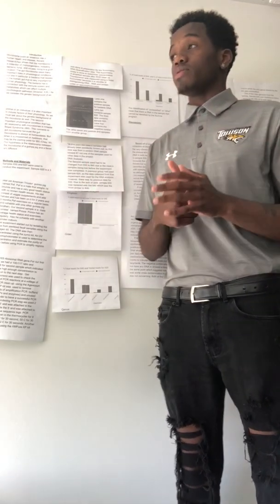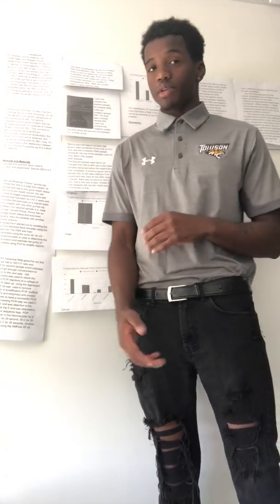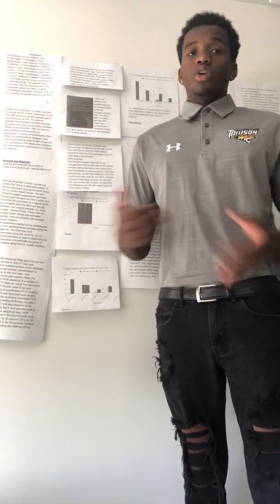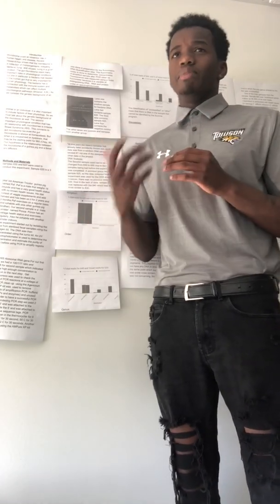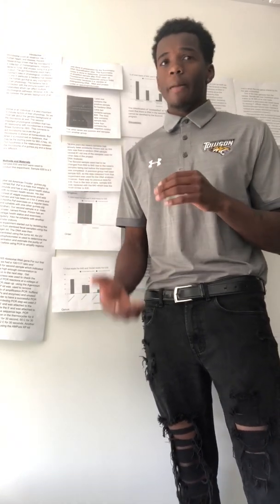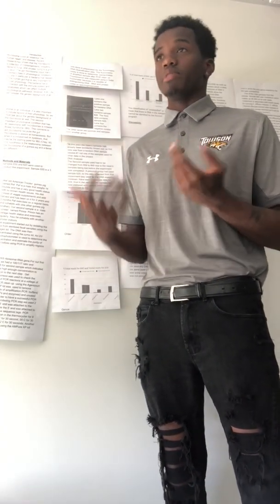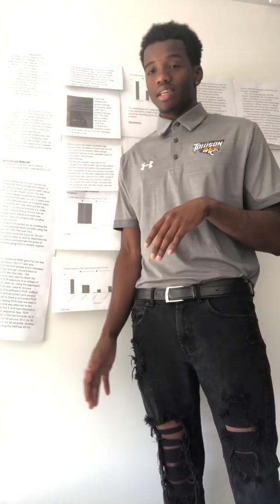Both samples had strong lines at 450 base pair, which trail the DNA, most likely because of the high concentration of DNA in both samples. So that's why it looked like that. But knowing this, we see that the reactions worked, because the DNA fragments found in the positive control match with the samples. And there was no presence of other types of DNA, which meant the bacterial DNA had been successfully isolated.